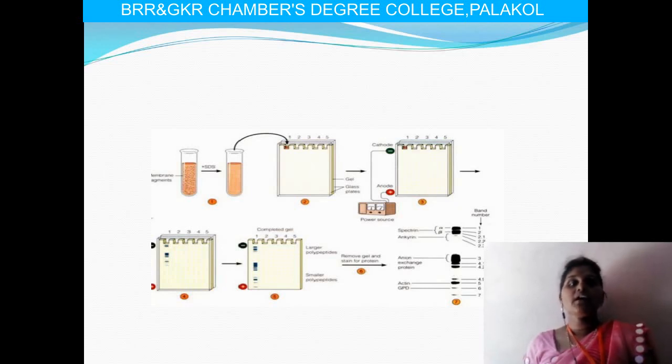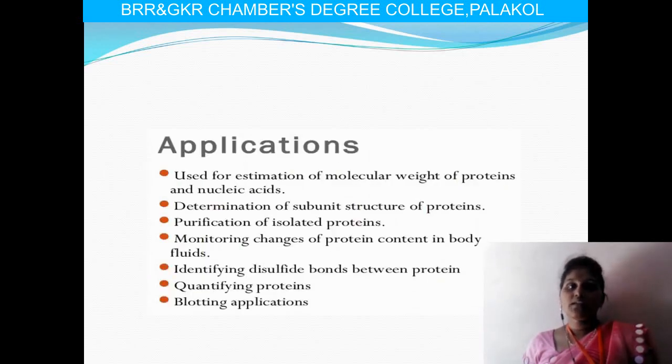That is the process of SDS-PAGE. The next one is applications. It is used to estimate the molecular weight of proteins and nucleic acids, and also for determination of subunits of the proteins, and also used for the isolation of proteins, and also monitoring the protein content in the body fluids.